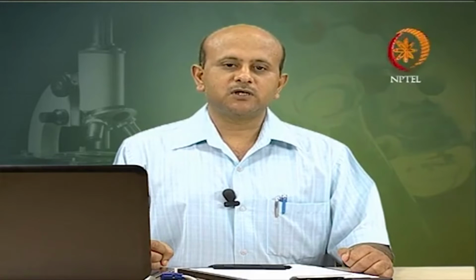Now, all these centrifuges we were seeing were simple centrifuges where you keep your volume and work upon it, but there are also other centrifuges like continuous flow centrifuges. As the name suggests, there is a continuous flow of material, with an inlet and an outlet. These are relatively simple centrifuges and they could go to high speed. So, these are high speed centrifuges.